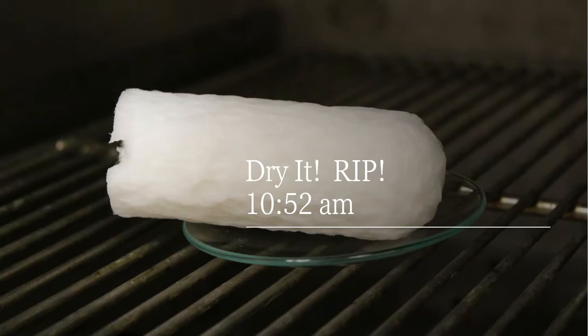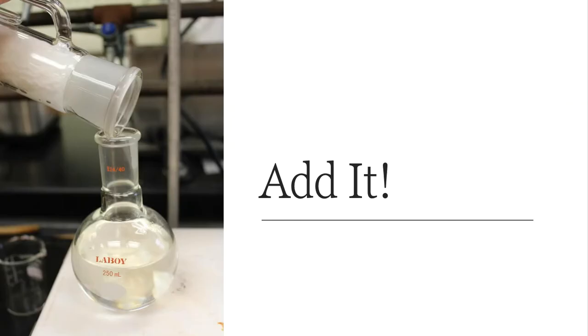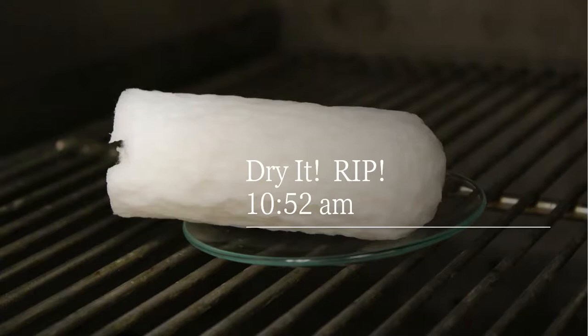Now, here's the problem. As you can tell, the thimble is kind of a tight fit in that Soxhlet extractor, right? I mean, I almost picked one that was a little too wide. So I had a kind of a hard time getting this out. So I took a pair of tweezers, and I was trying to wiggle that thimble out of the extractor. When I did that, I actually ripped a little bit of that thimble up here at the very top.